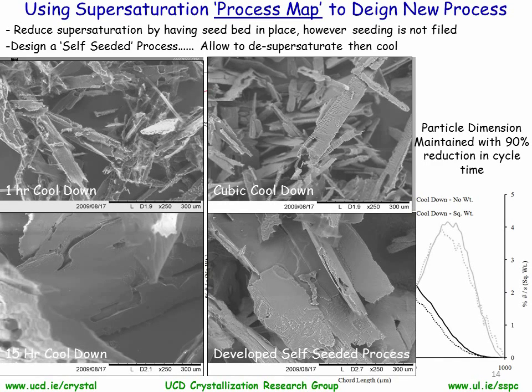So again, this really highlights the importance for us as a laboratory of combining bulk supersaturation and product dimension information via IR and FBRM, as this really allowed us to design and understand an efficient crystallization process.